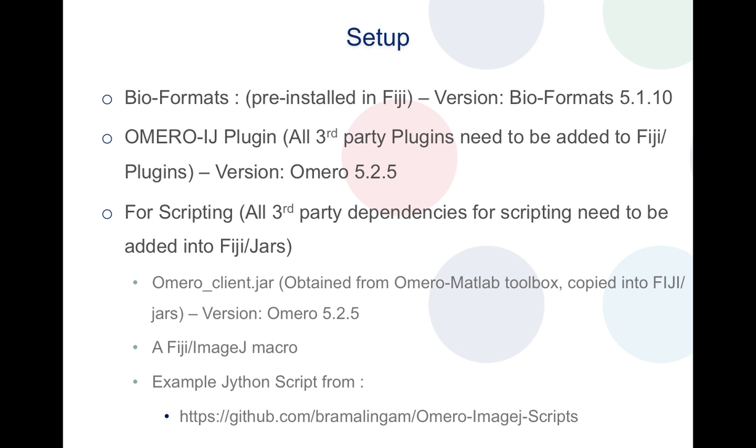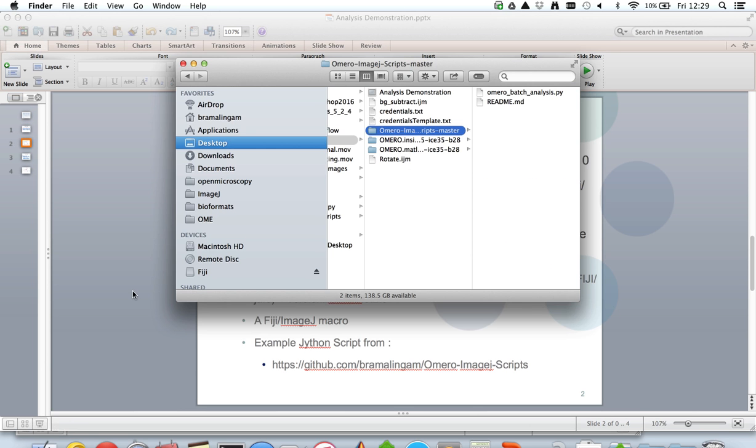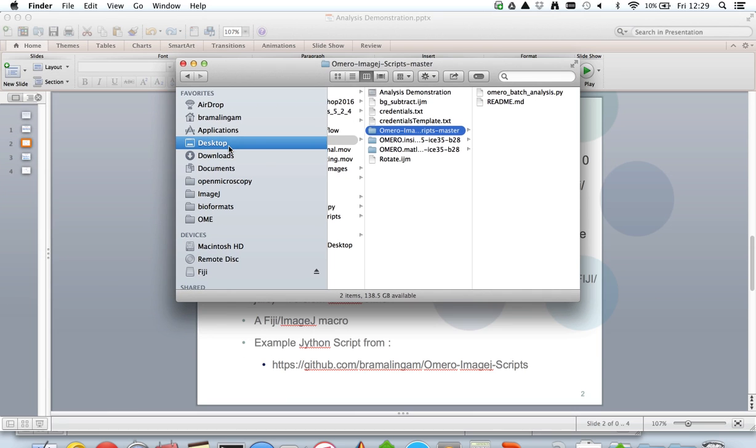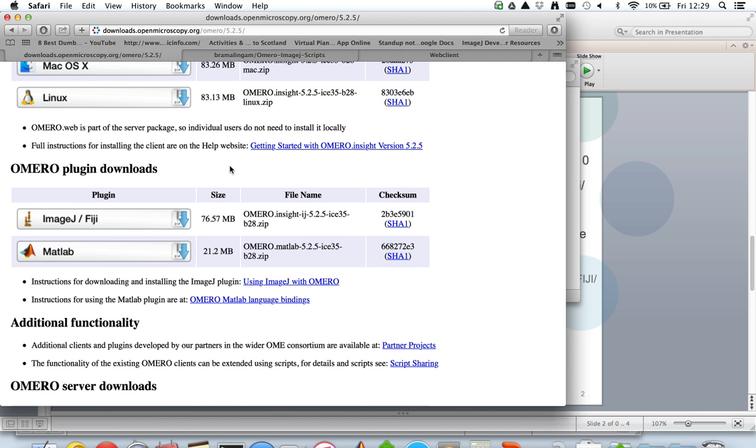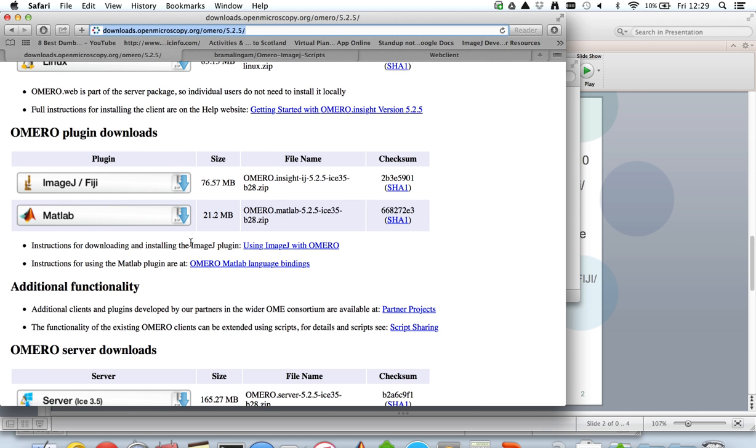Now that we've seen the summary of the setup process, let's go into the actual setup. As I said before, I'm downloading all the dependencies from the OMERO downloads page, version 5.2.5, and the specific downloads that I was talking about are under the plugin section: the OMERO-ImageJ plugin and the OMERO MATLAB toolbox which contains the OMERO client.jar.